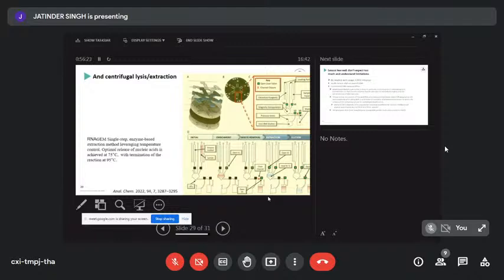This is a sample preparation where they realized solid phase extraction is hard because you need to pack beads into a microfluidic device, which is painful, time consuming, and has a high failure rate. So they developed an enzyme cocktail that can do the lysis and the DNA cleanup by itself. Again, this is a spinning disc, so no pump is needed. It's rotating around, and the centrifugal force drives the liquid movement. There is a sample being collected on a set of nanoparticles.